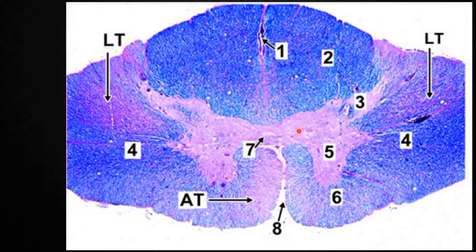So remember, the spinal cord is focused in a simple microscope. Even the umbilical cord is also focused in a simple microscope. Okay, so remember these two slides, guys. Okay, that is about the spinal cord.